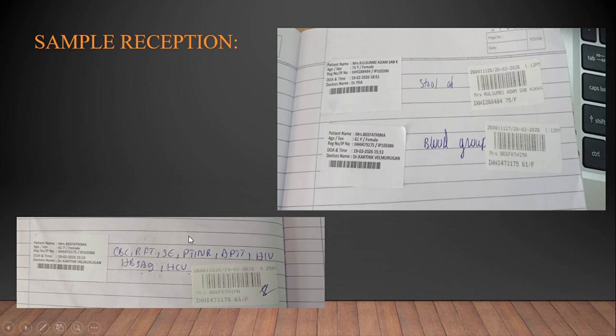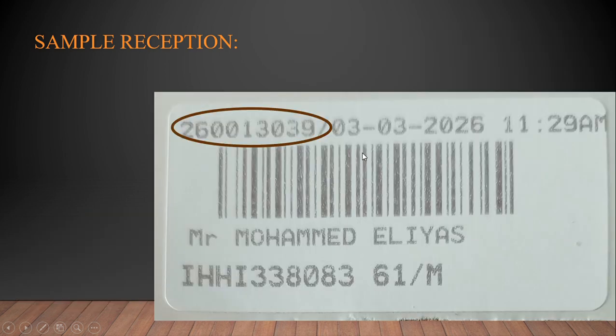So what happens is the HIS will show the request generated at 12 o'clock or 1 o'clock in the night, whereas the sample is received only in the early morning. So there will be a disparity. For that reason, it's important that we put our own barcode telling that we received such a sample at this time, and we sign it further to tell that yes, we have received that particular sample. Okay, so this is the whole idea of why we are again signing in the book. Otherwise, normally from the HIS itself it would have been over.